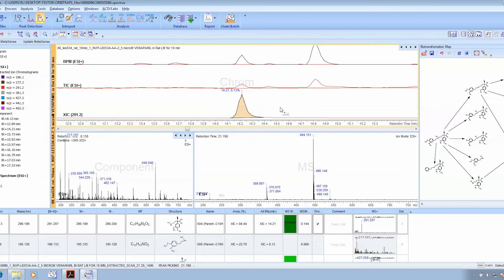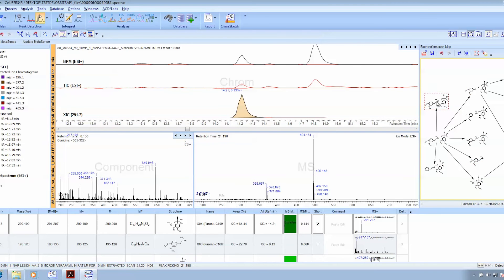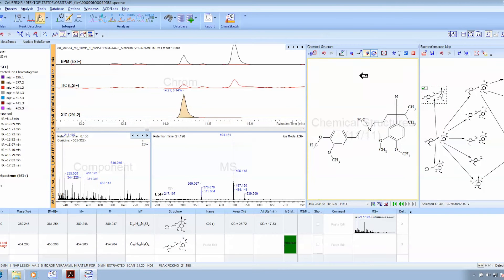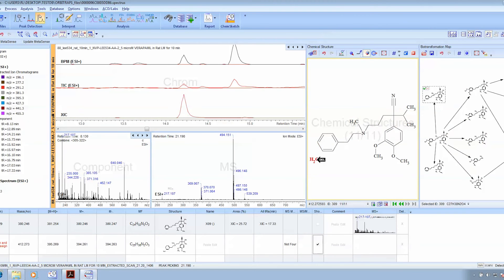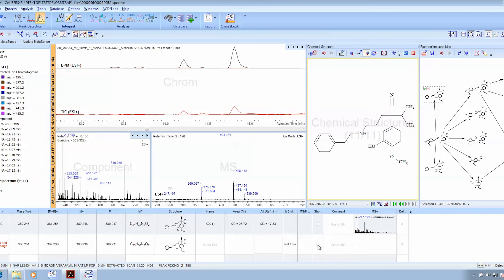Or if we wanted to, we can adjust the biotransformation map and add an additional structure to it. We can alter the structure simply within the processing interface and then tie the structure to a retention time within the chromatogram. You just have to do this once.